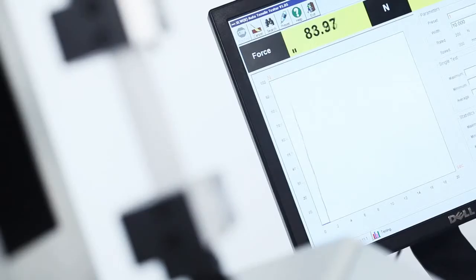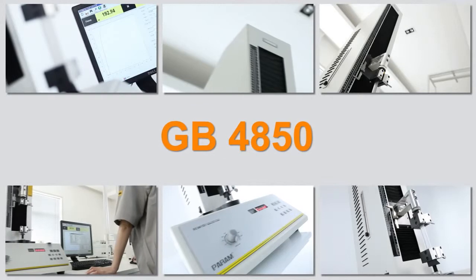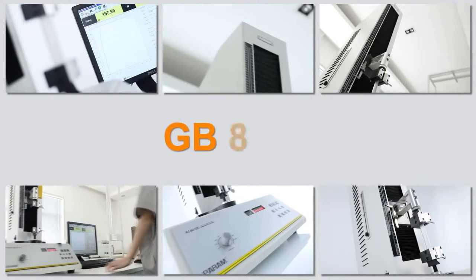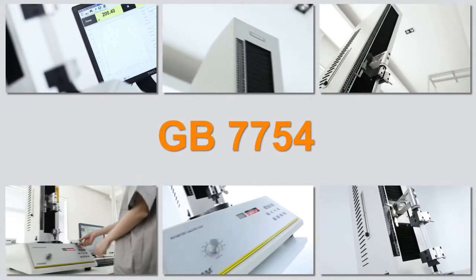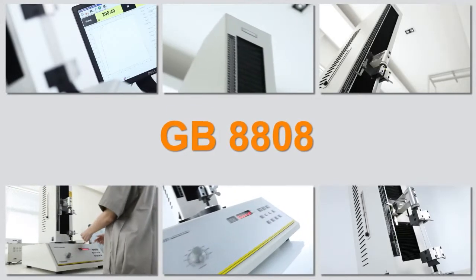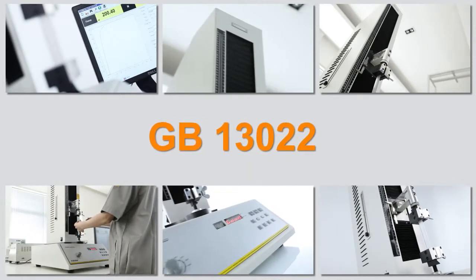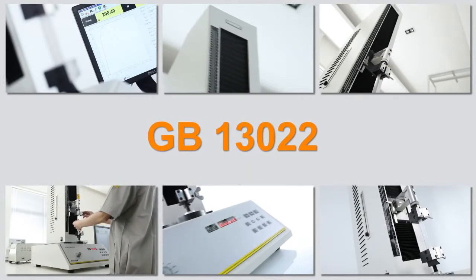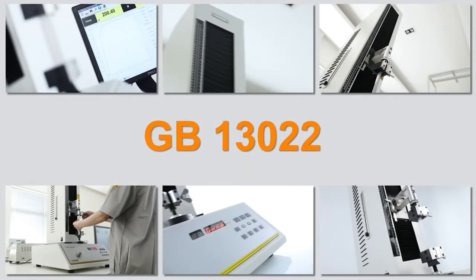The testing principle complies with GB4850, GB7754, GB8808, GB13022, and other national standards.